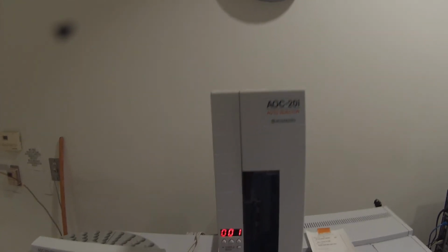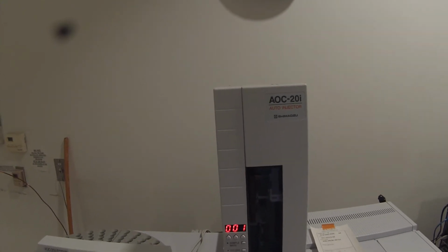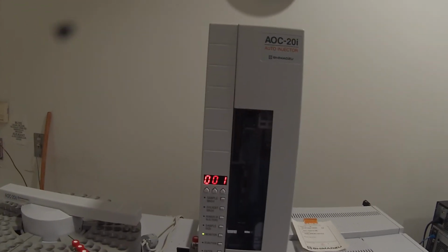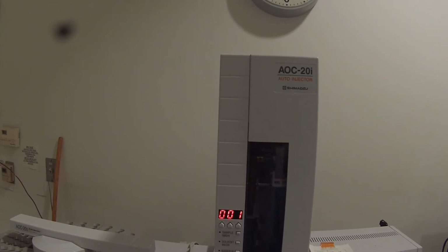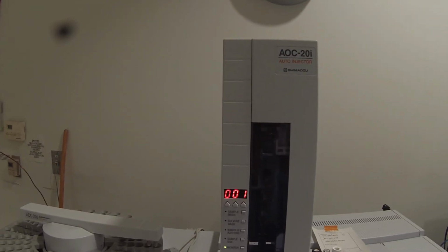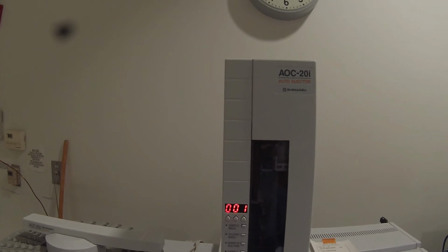And it's taking 8 microliters. And then it's going to wash it with dichloromethane. And I don't know if you can see the syringe moving in there. And then it's going to wash it with acetonitrile to make sure the syringe is nice and clean. And it's going to go and rinse twice with my sample, 8 microliters each time.